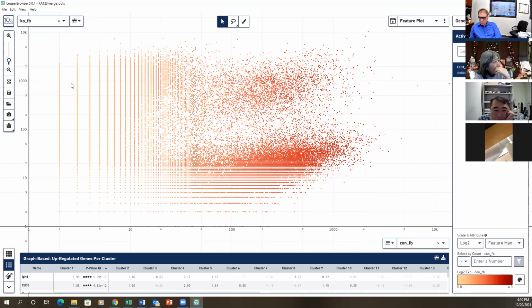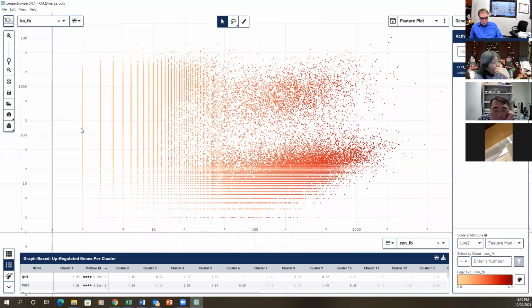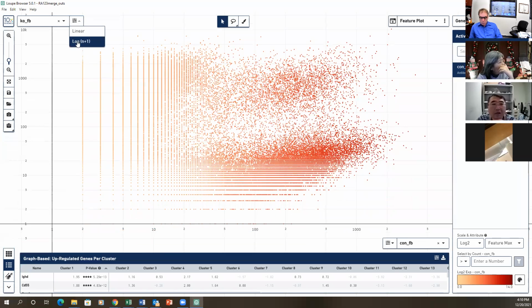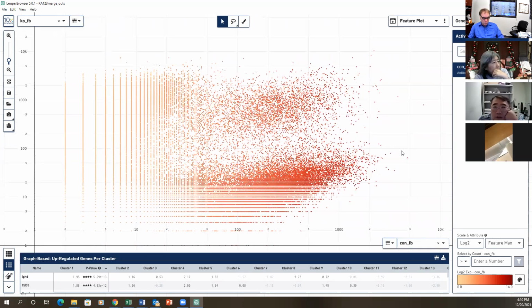But why then does the KO not look that good? KO doesn't look like a distinct population though. Let me see.